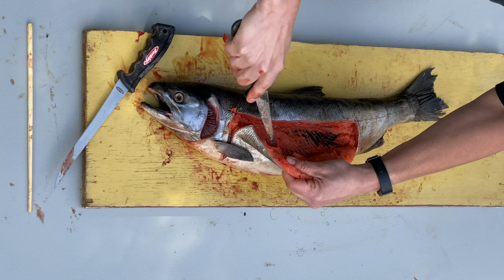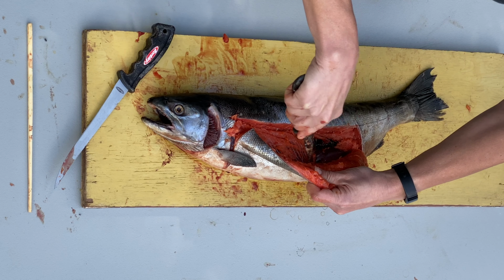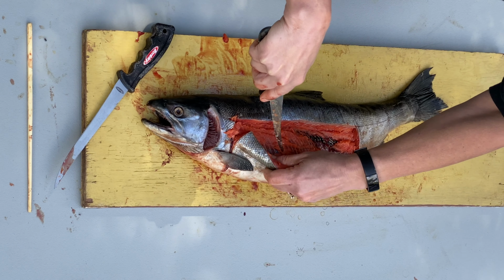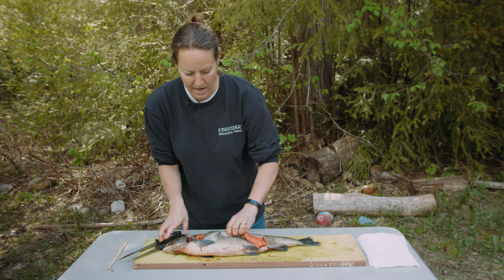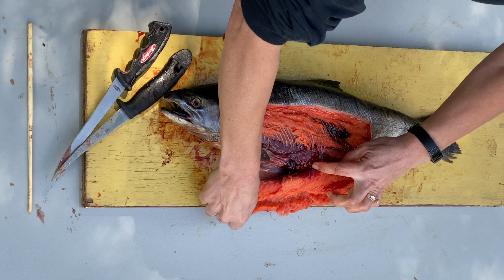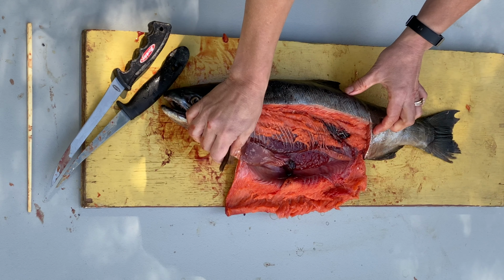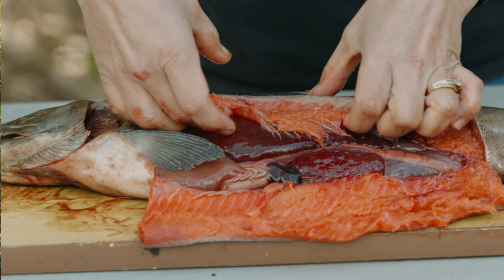So we're almost there. A few more cuts, and we're going to get there. 1, 2. Okay, so here we go. I'm going to open up the window, and there it is. So there is the inside of our fish. I'm going to lift the rib cage up.